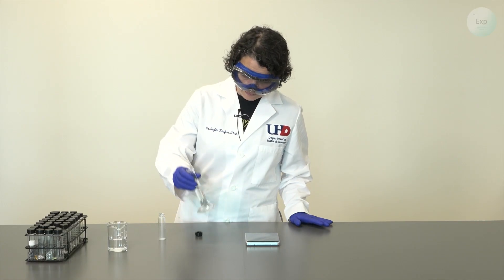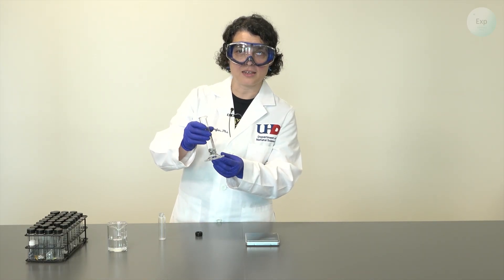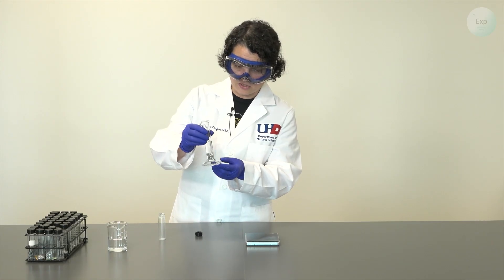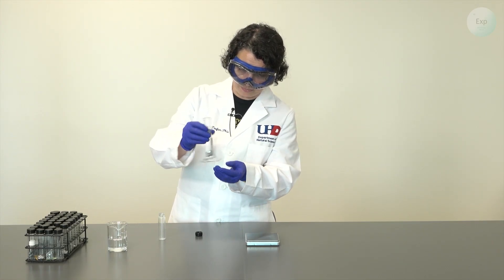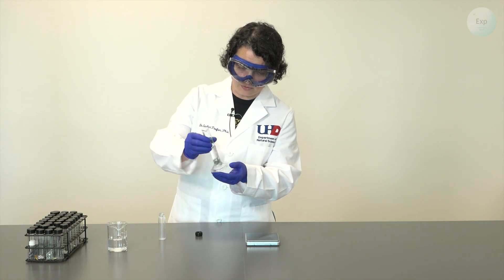Before we move further in our experiment we need to make sure that we didn't trap any air bubbles inside our graduated cylinder. So if it seems like there may be air bubbles we can shake it a little bit and then the air bubbles should come to the surface.